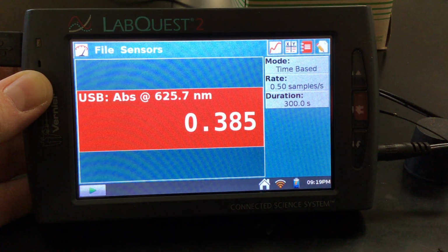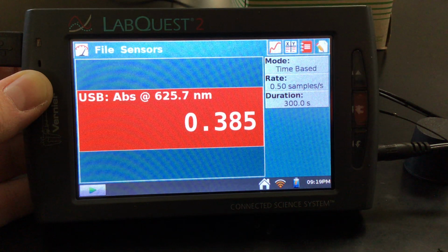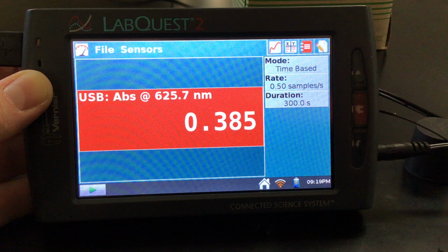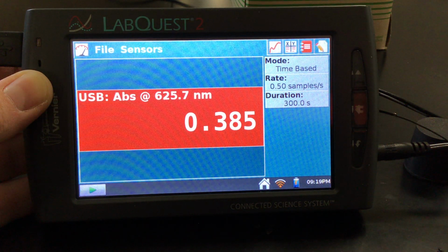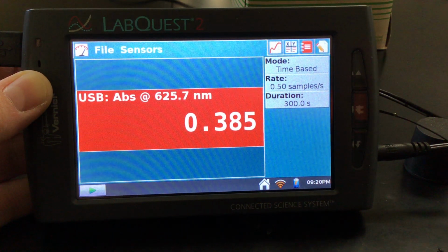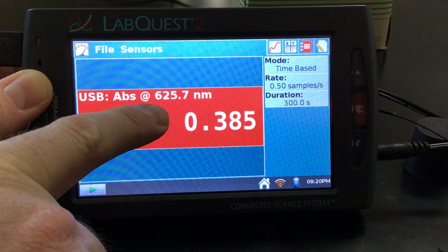And then what I did is that I took my stock solution. The stock solution is green food coloring diluted 1 to 10. So I took 1 milliliter of the green food dye, I diluted to 10 milliliters total. That's our stock. I took 1 drop of that and then diluted that with 10 milliliters of water. And then that was my solution that I used to determine the peak wavelength.